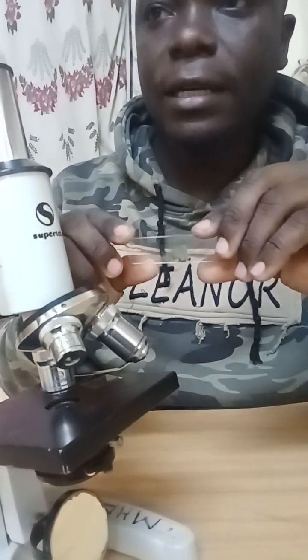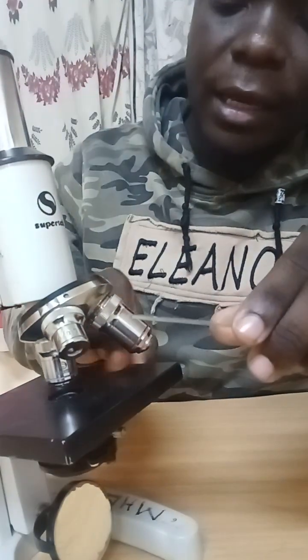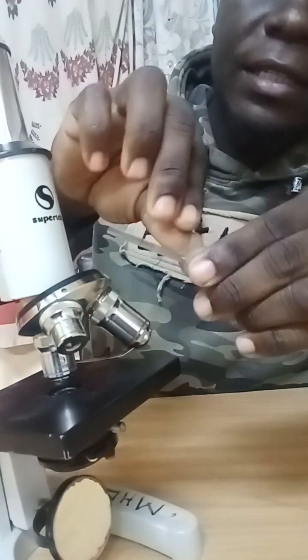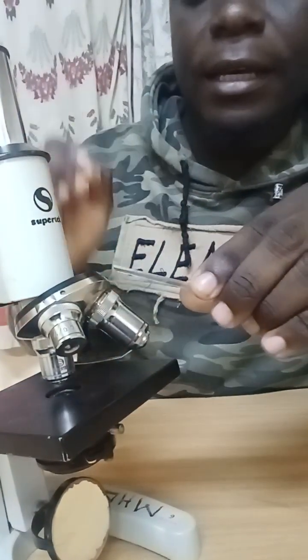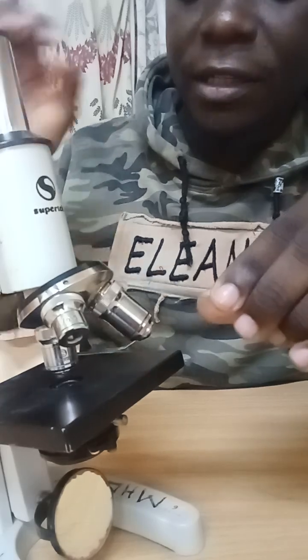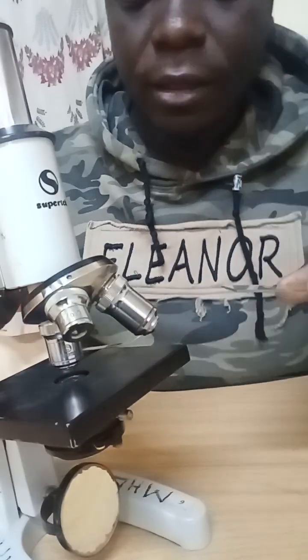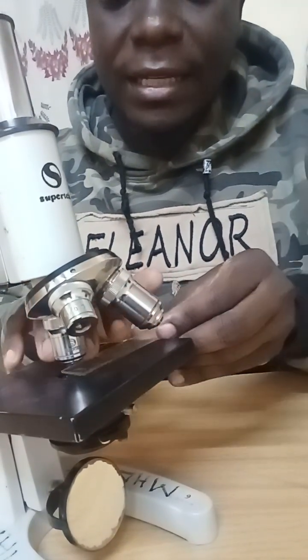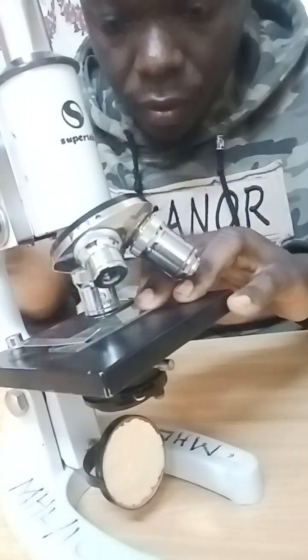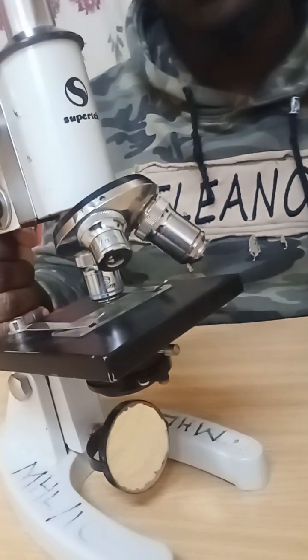We have two types of slides. You can have the glass slide. You place the specimen here, then you place a cover slip, and this cover slip is important because it covers the specimen to be viewed, prevents dust, and helps distribute the specimen equally on this glass slide. So therefore, this glass slide is placed there on the stage. Then we have the clip which holds that specimen in position.